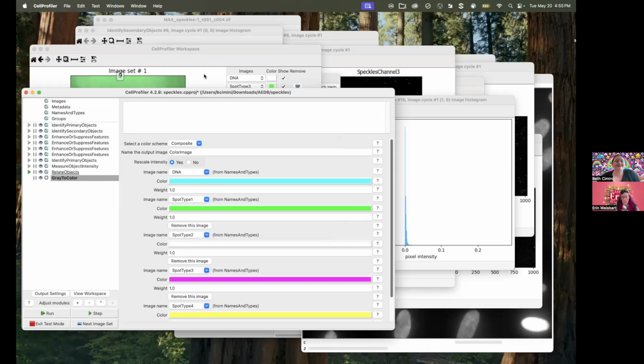If really what matters to you is just count, then that may be a very different sort of object overlay than what you would look for if you were looking for more complex, intensity-based relationships, and so your biological knowledge would be very important for the final choices that you make in such a pipeline.